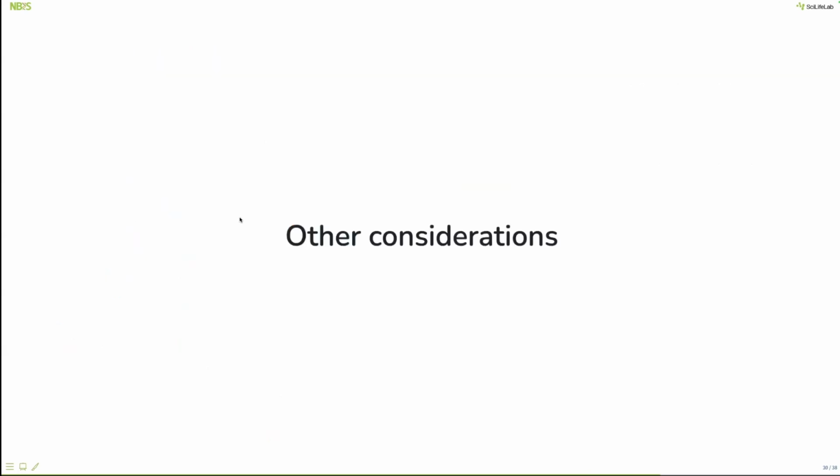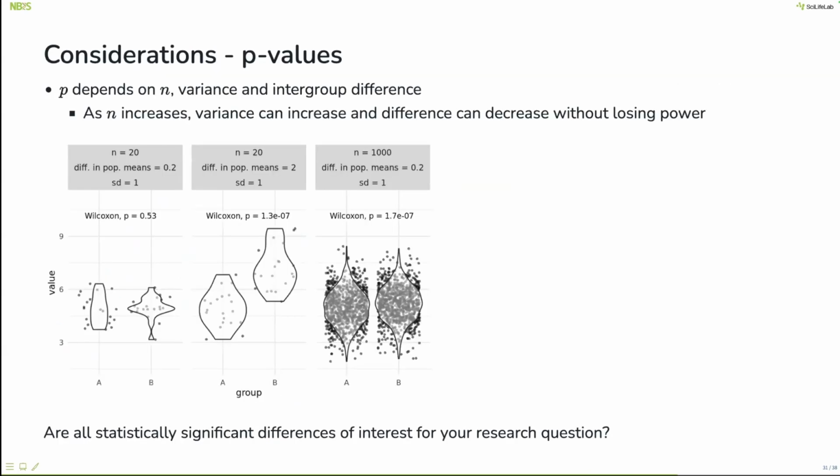Finally, some other things to think about. I want you all to be aware of the p-values being easily very small in single-cell data. This is partially because people use independent assuming tests when they shouldn't. But it's also just because we have a lot of cells and we're typically not used to working with such a large N in biology.